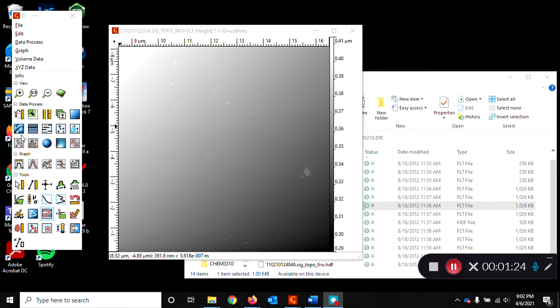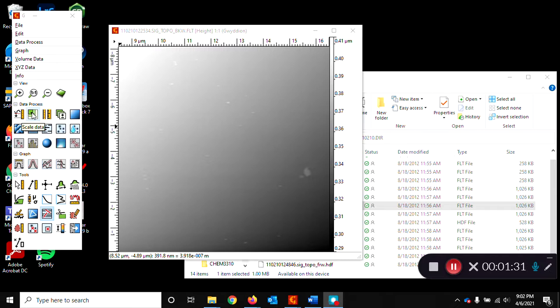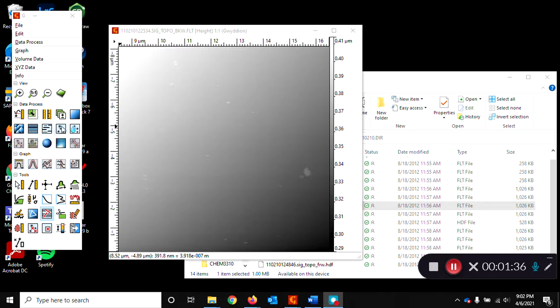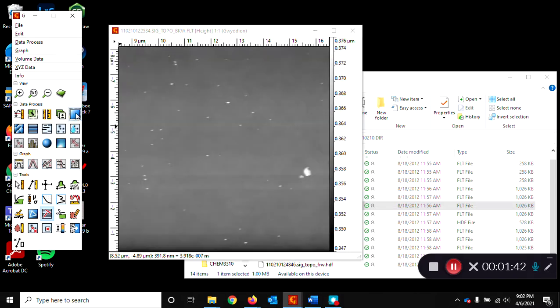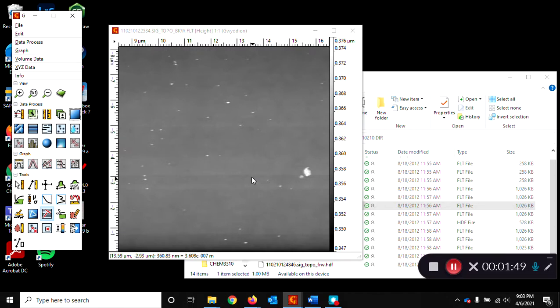So here in the data processing group of tools you can see a number of different icons and if you hover over them you can see what the tool is for. Here we have a series of flattening type tools. Let's try this one. So you can see that did a pretty good job just as a first pass and that'll actually be good enough for this image.